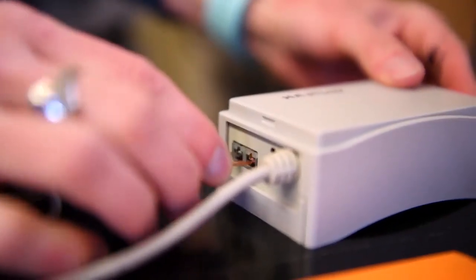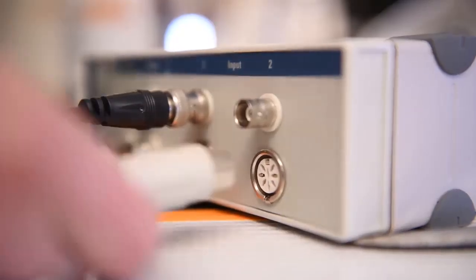Plug the thermistor into the T-type pod, then plug the T-type pod into the channel 2 port of the power lab data logger.